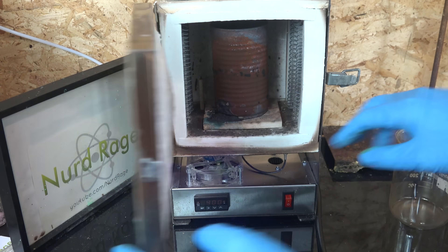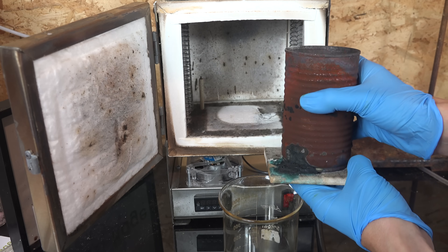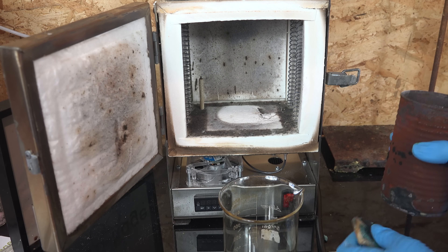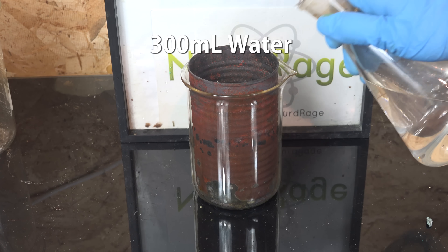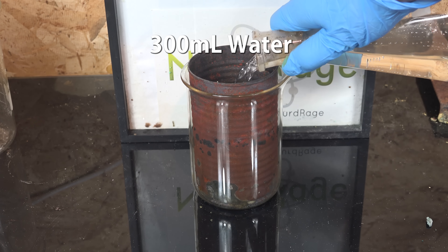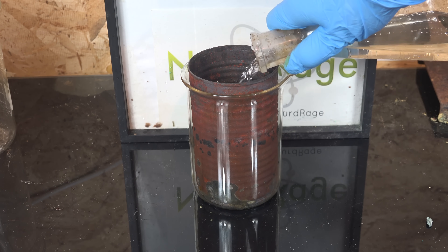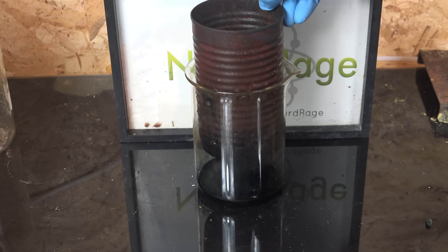After heating, I let it cool and took it out. The extremely corrosive mixture actually ate a small hole in the can and leaked out a little bit, so I'll keep it in a beaker to contain everything. About 300mL of water is added and allowed to soak for a few hours, to permeate into the mixture of potassium manganate and potassium chloride and make it easier to break up.